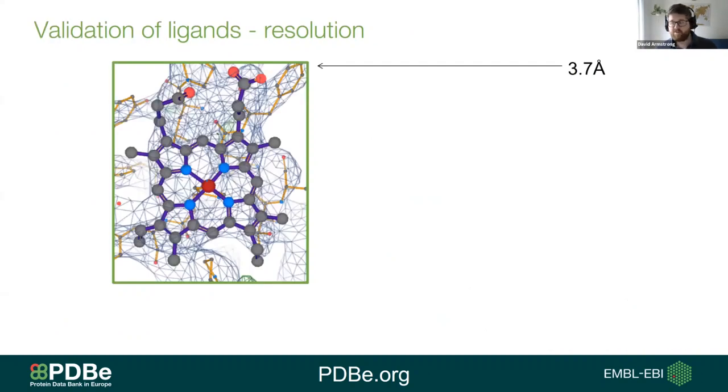The other thing to bear in mind when looking at ligands and binding sites is validation. There are a few different points I wanted to make in terms of validation of ligands, helping you, when it comes to making conclusions about ligand binding sites, make the most successful interpretations based on validation of that experimental data. As I mentioned, this is why PDBe has experimental data, and it's now mandatory for all techniques to provide that experimental data, and why that's important.